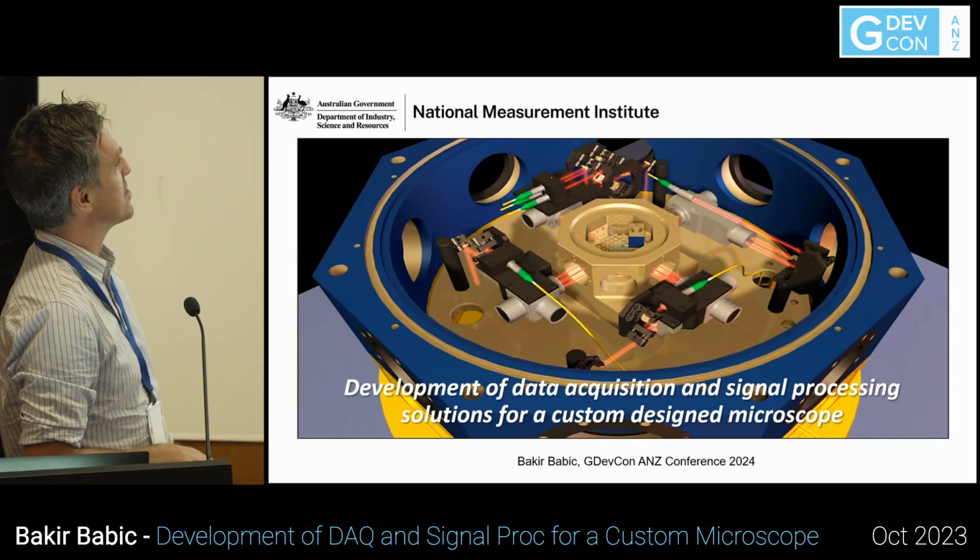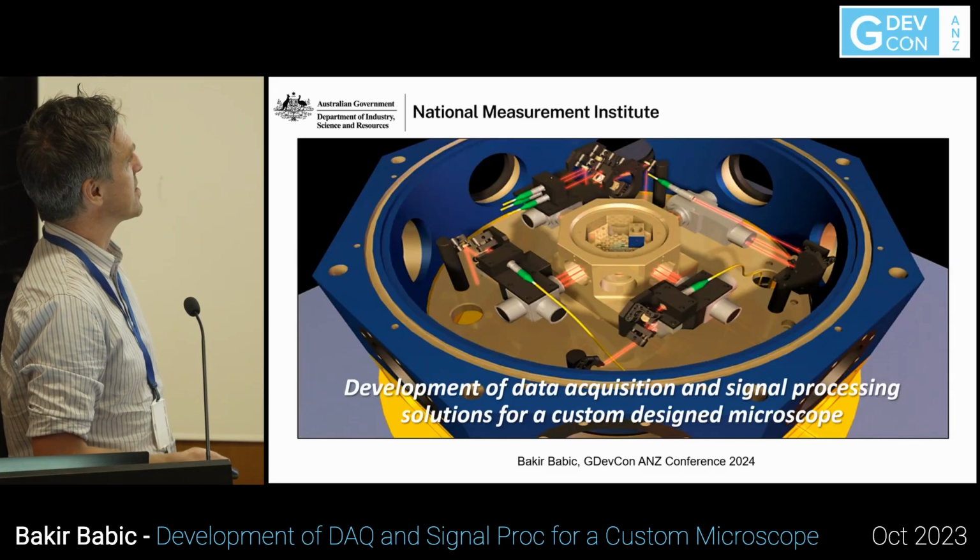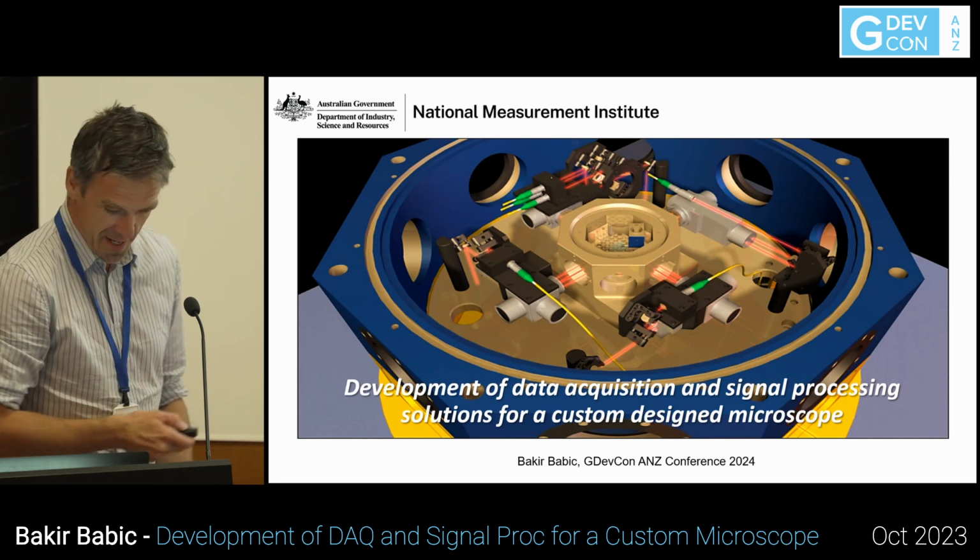Data acquisition system and signal processing solution for a custom designed microscope.